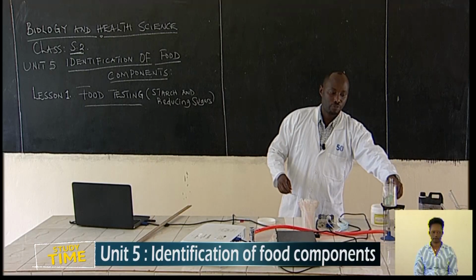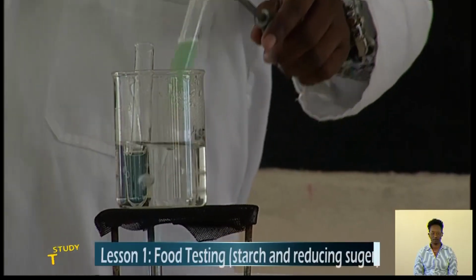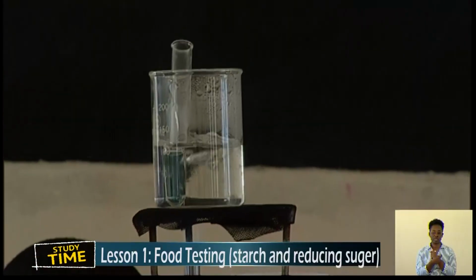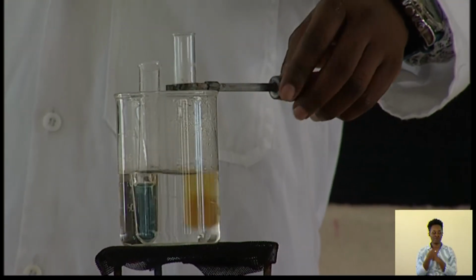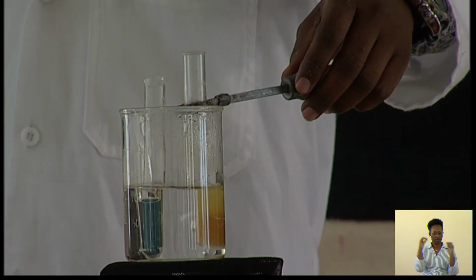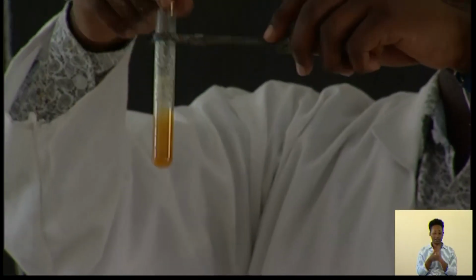The color is changing from there to the color of green. Then from green, it will change to, as you can see, from green. Then we try to heat and observe very clearly and see what is happening. Automatically, you can see there is something which is changing.